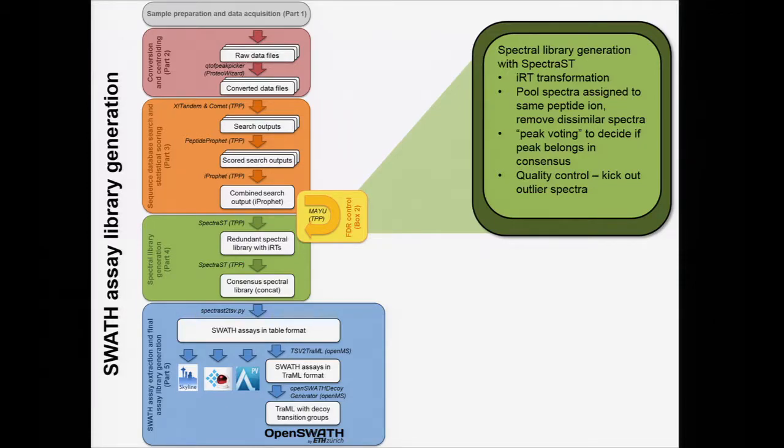Conceptually, this is an attractive idea, right? So if you have fragment ions, this goes to the matrix question yesterday, maybe you have an interference in a certain matrix, but a different interference in another matrix, and by averaging over these, the hope is that you will eventually get to a spectrum which is just representative of the peptide and the best relative fragment ion intensities that you can achieve for that peptide.